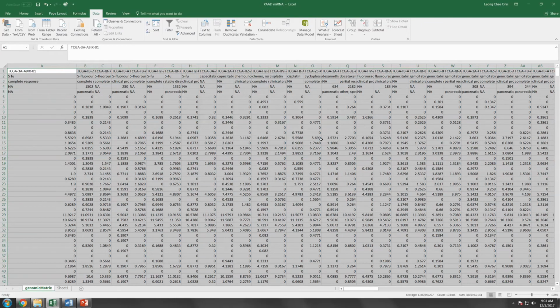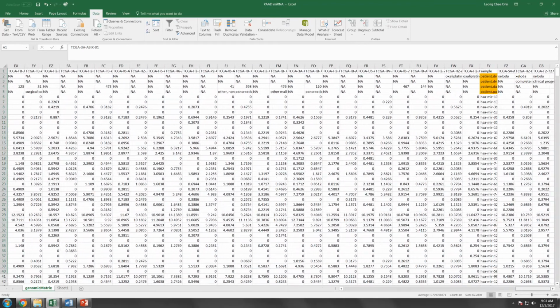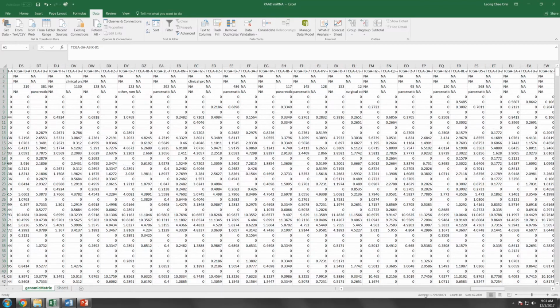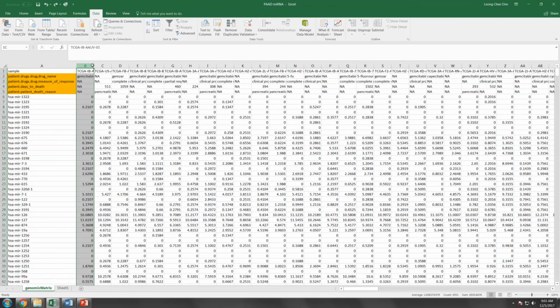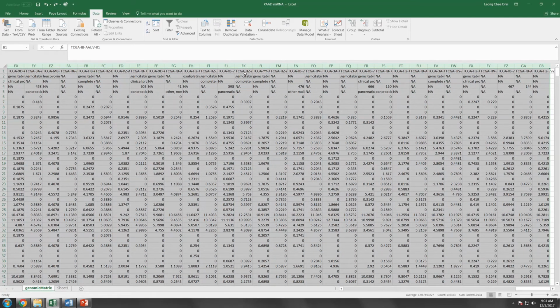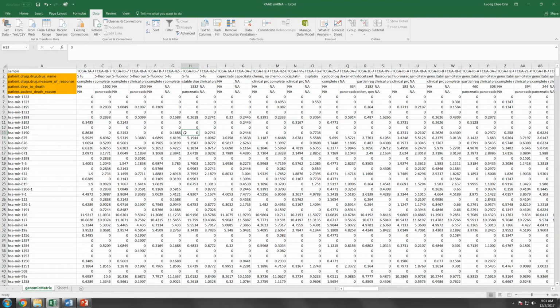When you do that, everything will be sorted, so you can see that here. Of course, your microRNA is also sorted as well, so now it is basically towards the FY column here. So I'm going to undo this, and I'm just going to select the information from here to do the sorting, so that I wouldn't mess around with column A. So column number 2, and then I'm going to sort it. Now here you go.